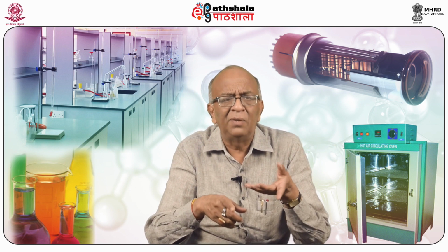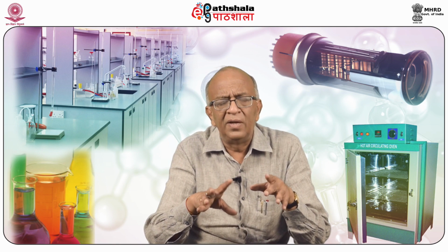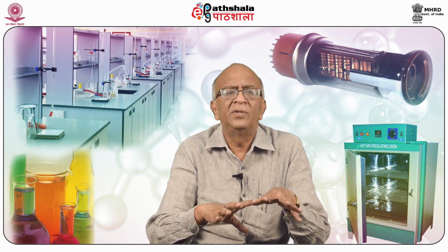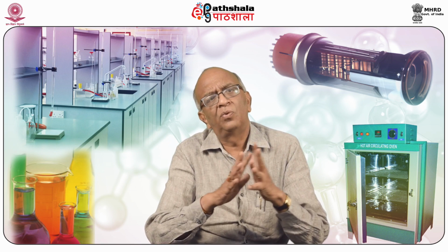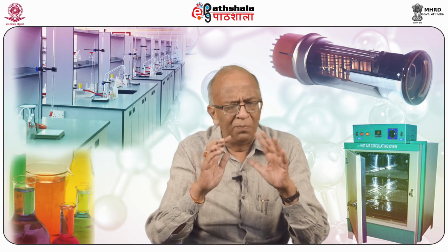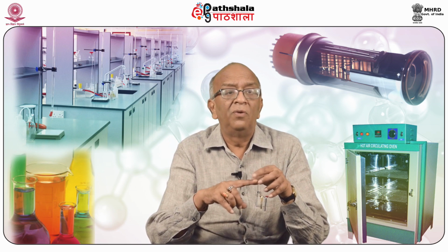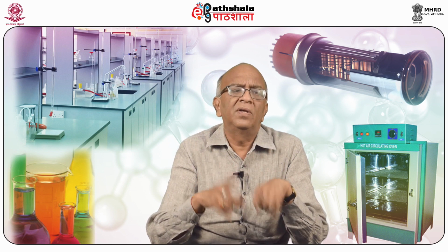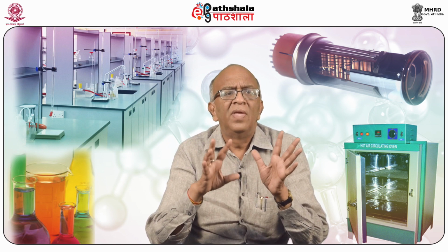So this is another method in case you are careless and have left your glassware uncleaned at the time of working. Then you have to clean the glassware by using this ultrasonic energy. But it is recommended and desired that immediately after completing your experiment, you should wash the glassware thoroughly.